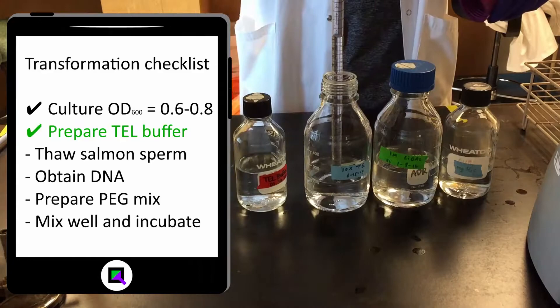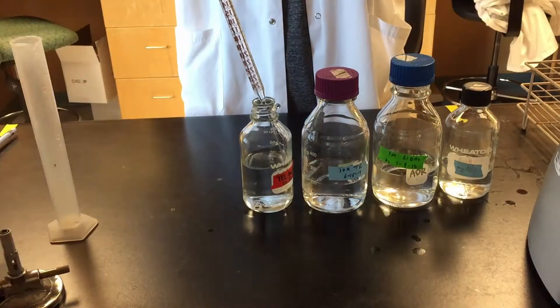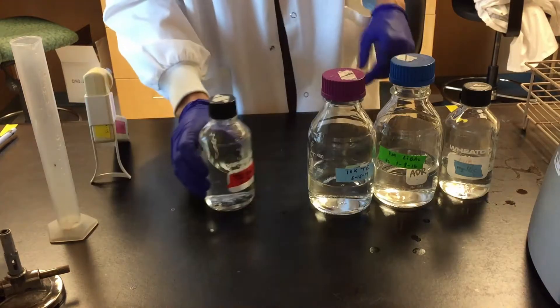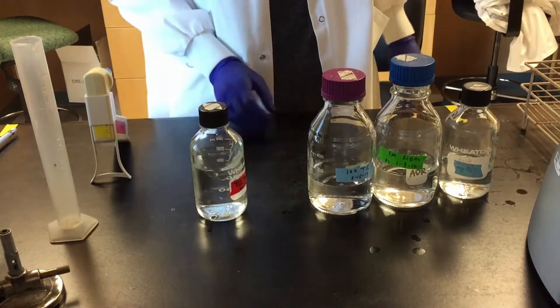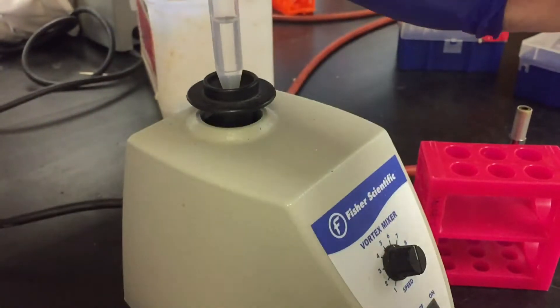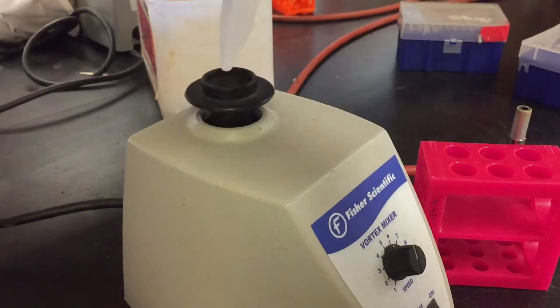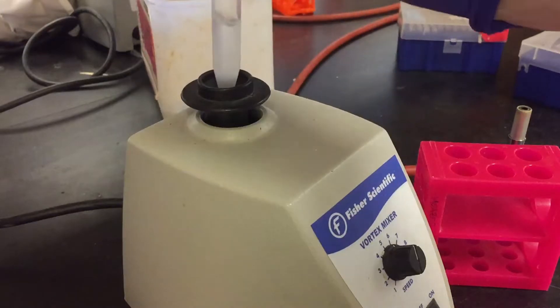Tel Buffer is just Tris, EDTA, and Lithium Acetate diluted in water. Add Tel Buffer to the tube and vortex or invert to wash.